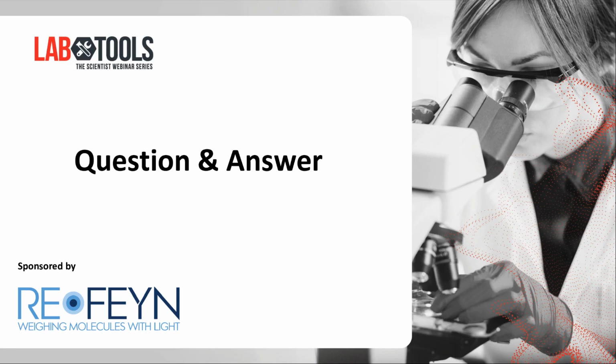So, I guess to start, can this be used for integral membrane or transmembrane proteins? And have you tested proteins in nanodiscs or micelles with this technique?